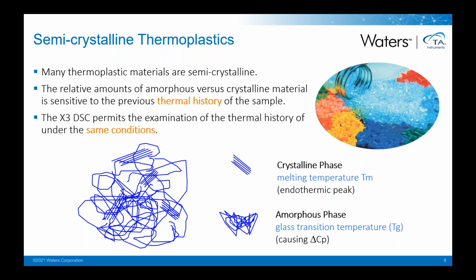And in those cases, you're going to associate those phases with a performance metric, some end use case where it has to be flexible at room temperature, or it has to be able to withstand some impact and those sorts of things. So you're going to try to formulate a material so that it has the right properties.